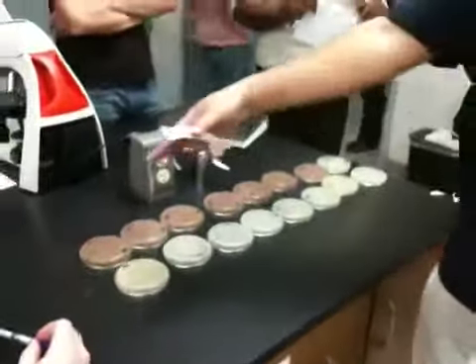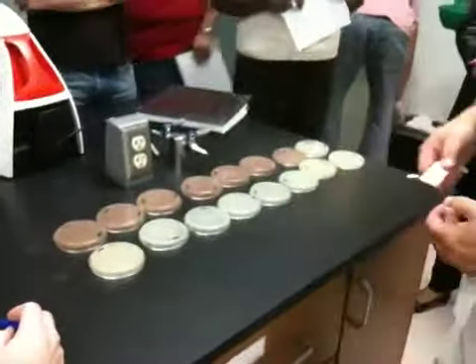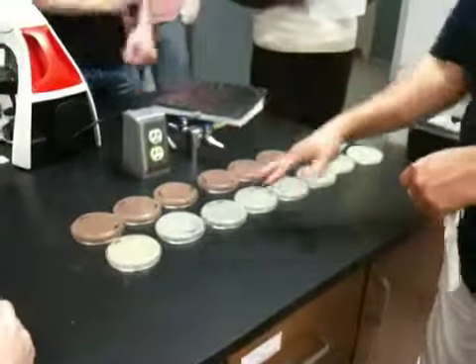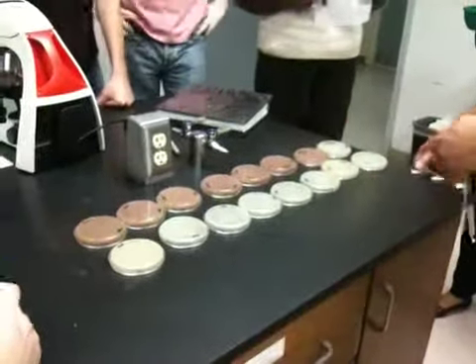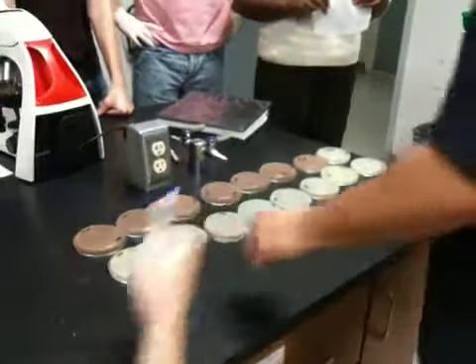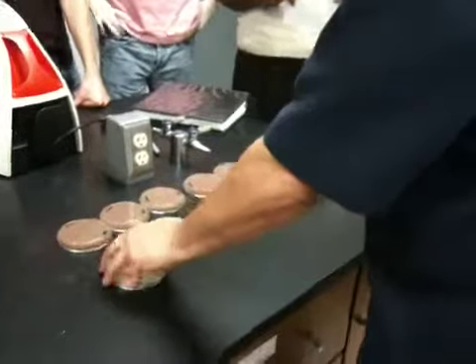Where this first set was done improperly, the person who was helping me out didn't take the lids off, and so everything was protected. This is the one that Naga did, and it works beautifully, right? So what you see here is growth at the control, which we were supposed to see.